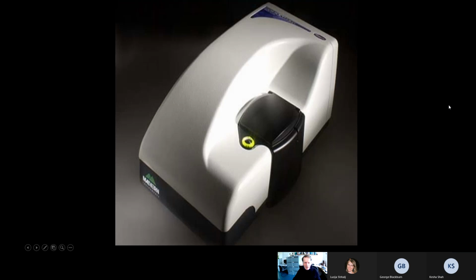Yes. So, what's one of those? What is a small box, as most instrumentation is now? It's all enclosed in the box, for a good reason, because of health and safety. But can anyone guess what that instrument is here? Spectrophotometry. Well, it's like a spectrophotometer. Colorimetry. This might give a clue.